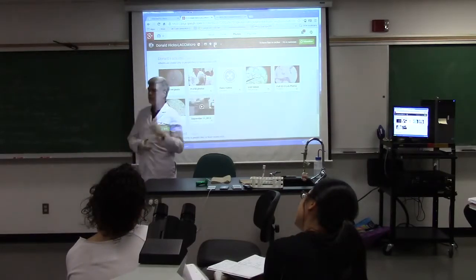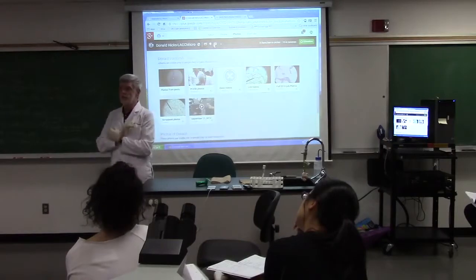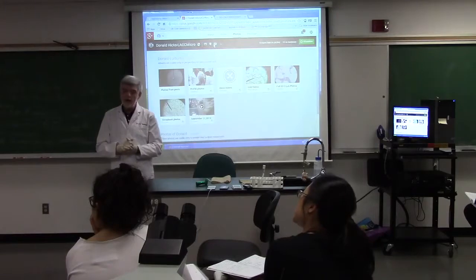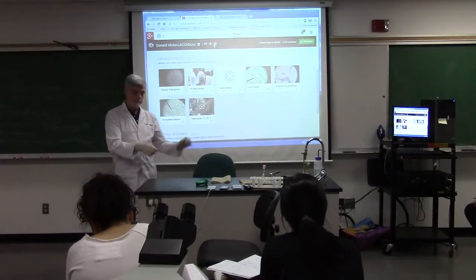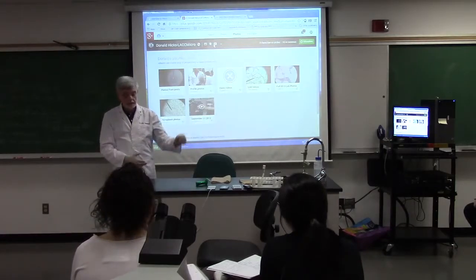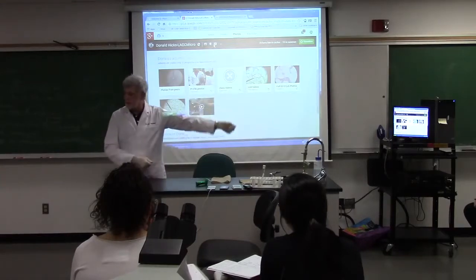So any questions about what's coming up, what we're doing tonight, how we're going to run the practice lab practical, and how we're going to run the real lab practical? Yeah. You said we're making 10 smears. Yeah, you're not going to air dry and heat fix them. You're just going to get the bacteria out of the tube. You'll probably dip into the tube 3 times, heat it, cool it. First, you're going to put all 10 drops on all 10 slides, and then you're going to scoop like 3 slides at a time, and then go back and pick up another.